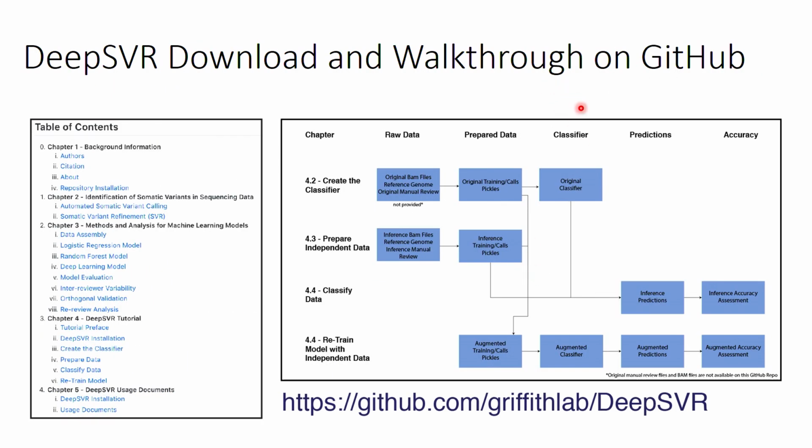Methods for downloading this software, for building the model, and for incorporating your own data into the model for development have been provided online in the GitHub wiki, and if you have any questions on how to go through that process, please feel free to ask.